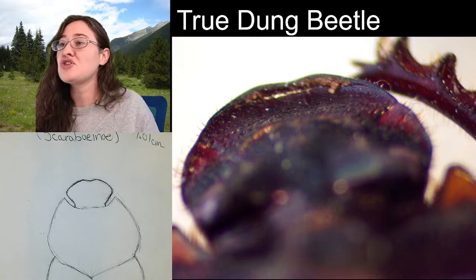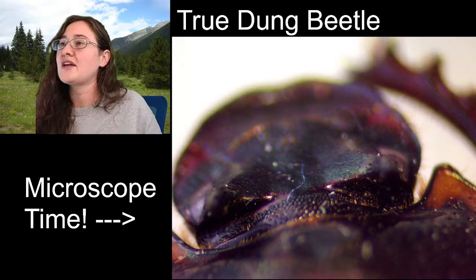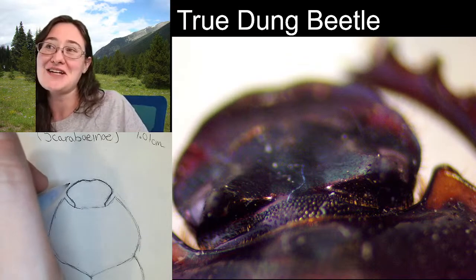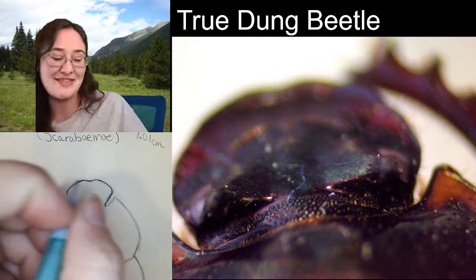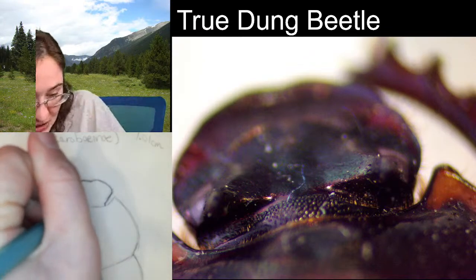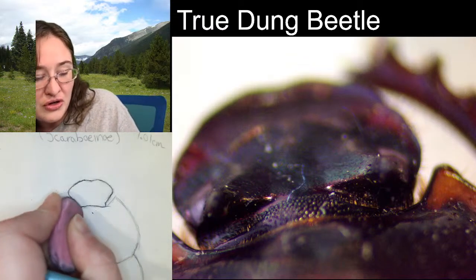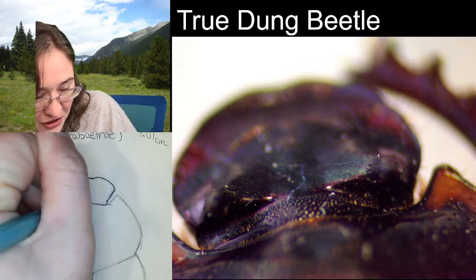I'm going to change the focus of our microscope really quick because I wanted to see where the head connects to the pronotum. I've avoided doing dung beetles because I know their body is on so many levels, but I think that we've got this. So I wanted to add, at least right here, I'm noticing that there's an arch that comes up towards the head, and I want to make sure I give that some space and some consideration when I am doing the horns.